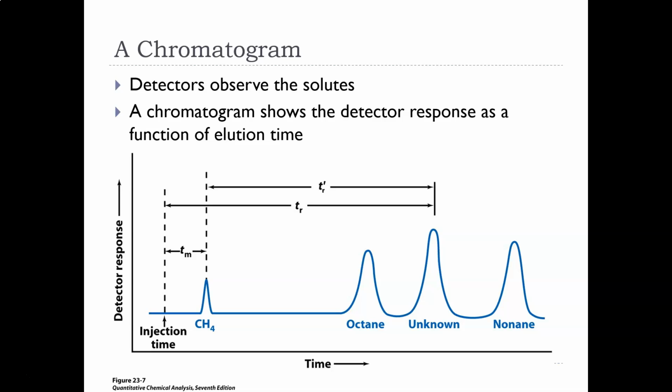So the chromatogram looks like a graph, but it's not true. I mean, the graph is the time along the x-axis, and the y-axis is whatever the detector response is. And we're going to get into that a little bit more in chapter 22. But for right now, it could be anything from absorbance, could be the y, or just think of it like number of molecules or something.